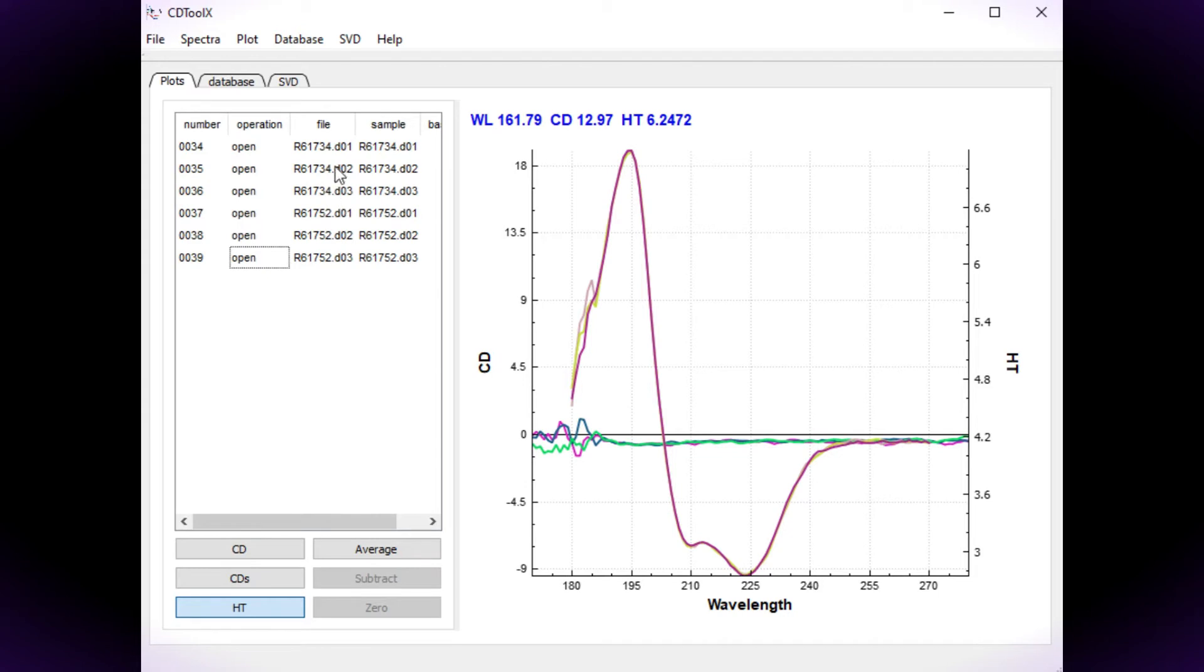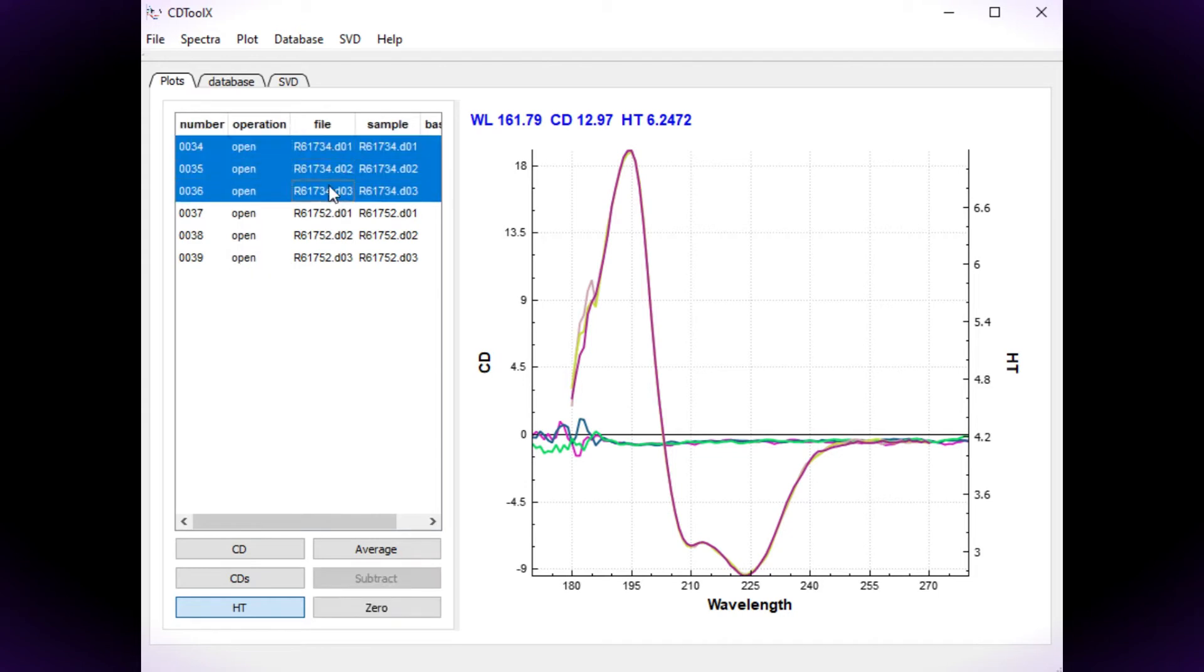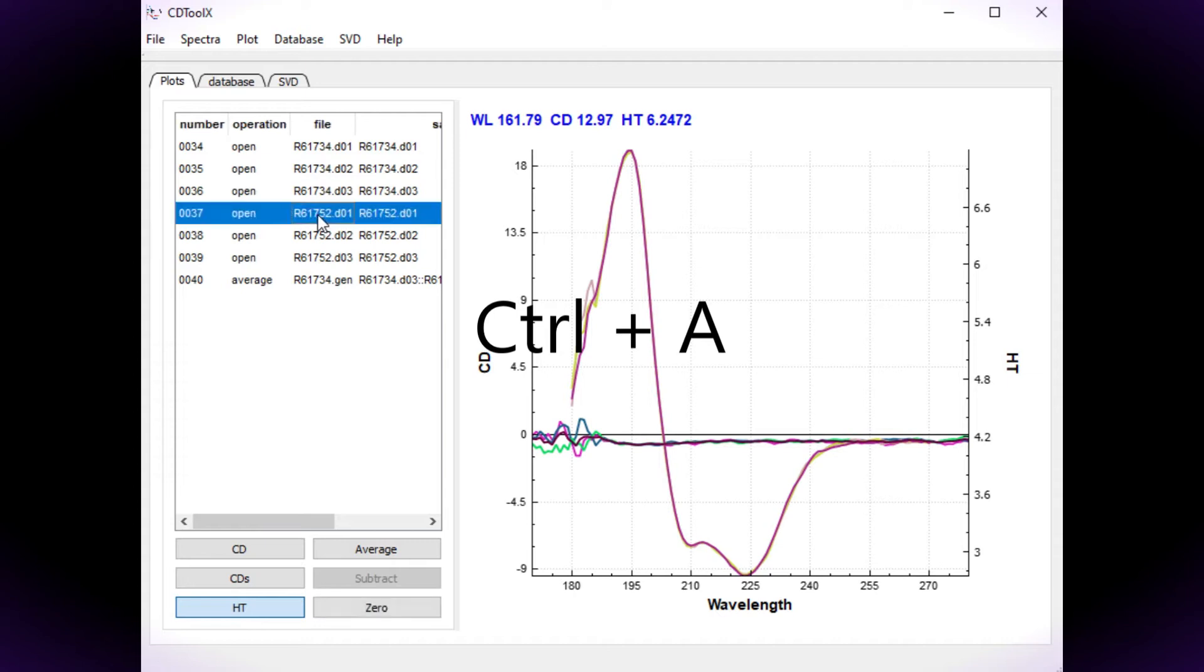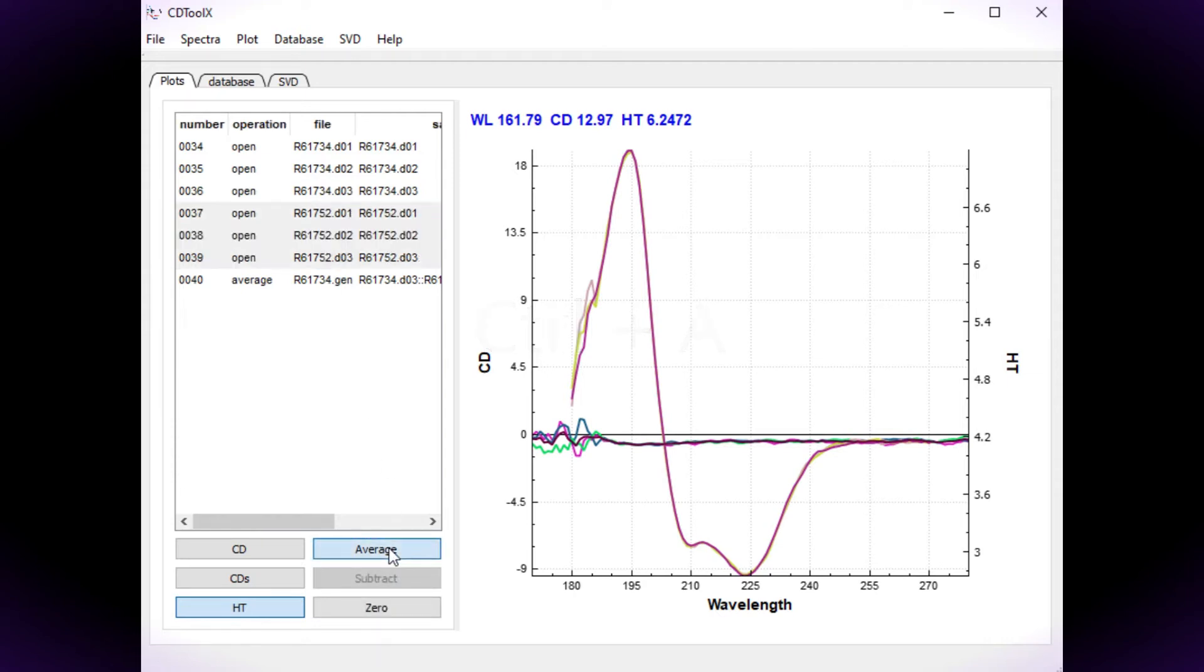Select three baseline files and click on the average button or use Ctrl+A on the keyboard. Now average the sample data.